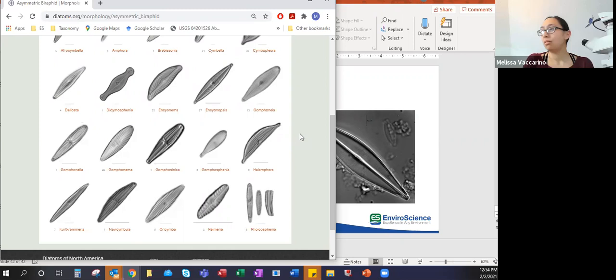So for analysis, when we do these counts, we will have a secondary count. And so in a quality control, if the two taxonomists looking at this can determine these species variants, then perhaps you'd want to keep them. But we don't usually find a lot of overlap sometimes for these guys. And in assessments where there's a large number of samples and a large number of taxonomists, I think we feel better lumping these.